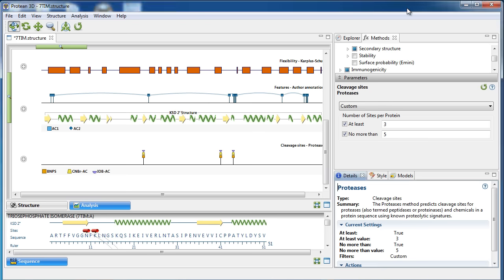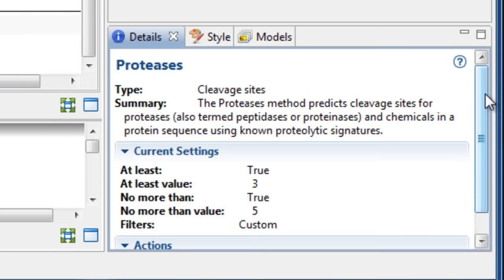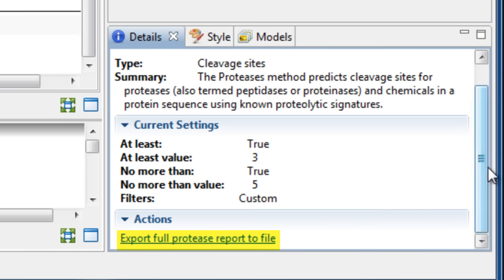Finally, you can create a tab-delimited text file containing information about the cleavage frequency of the compounds. Simply open up the Details panel, and then select Export Full Protease Report to file.